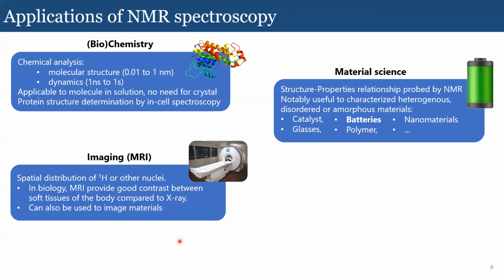Also, on a side note, I should mention that while MRI usually looks at the proton signal, you don't really need to use protons to get an image. You could theoretically, and we'll see later that it's in fact done, use other nuclei.